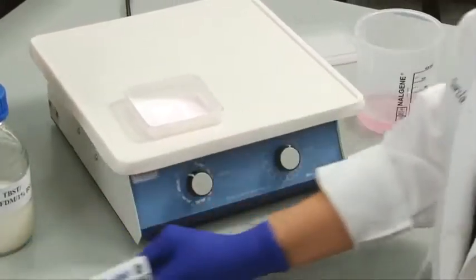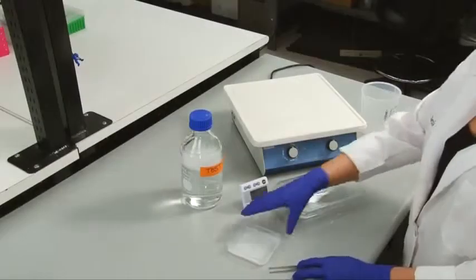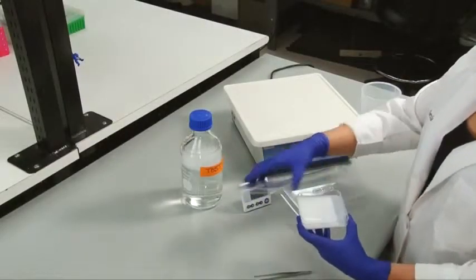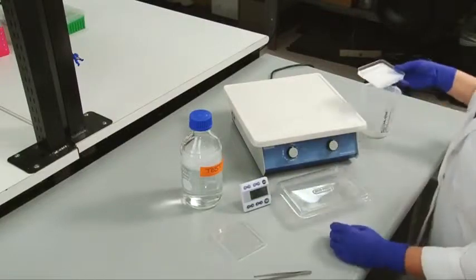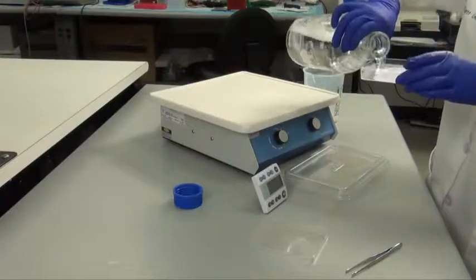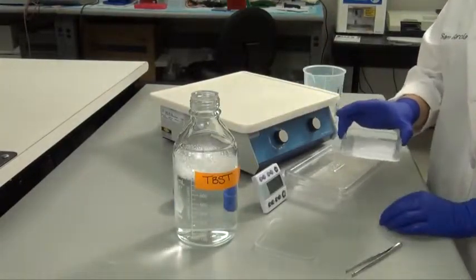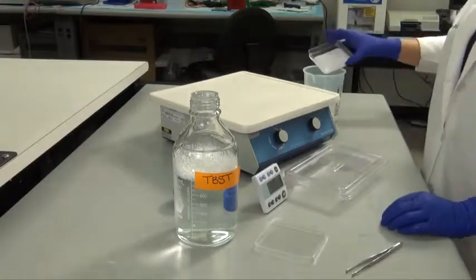However, do not use milk when probing with phosphospecific antibodies, as it can cause high background from its endogenous phosphoprotein, casein. Incubate the membrane with blocking solution for 1 hour at room temperature under slight agitation. Decant the blocking solution and wash with TBS tween for 5 minutes.